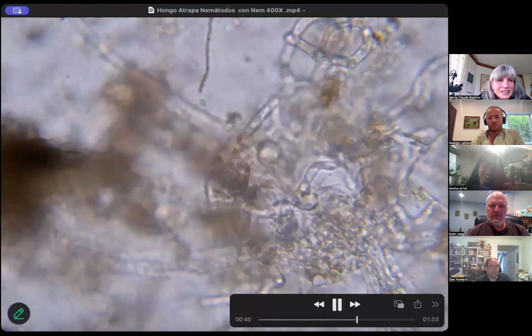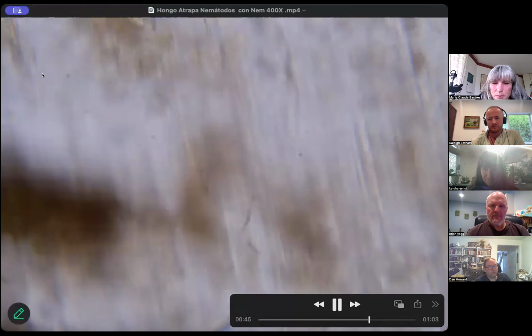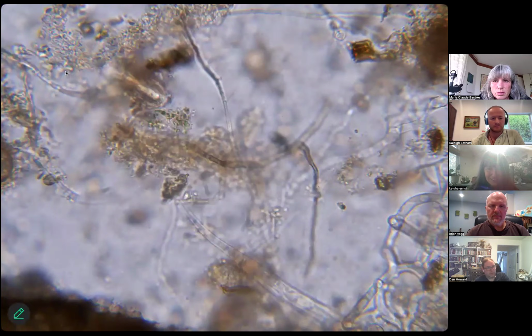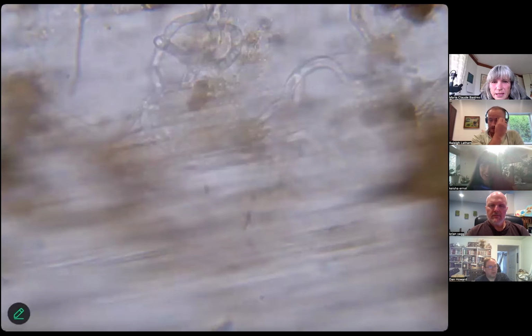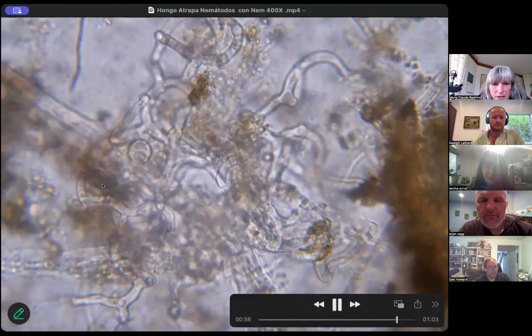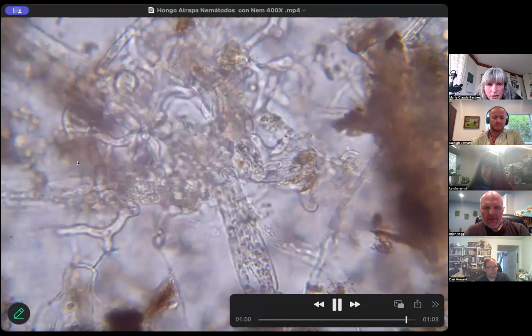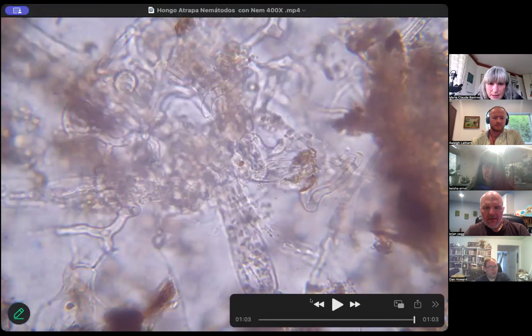Marie, what were you looking at in this sample? Was this a compost sample or a soil sample? Same compost sample, but from one month ago. Wow, a great different sample. It's so fun, there's a lot of diversity. Right there, it has a nematode. It's eating it. You can see the nematode, but it's very messy, full of rings, and this nematode is huge.